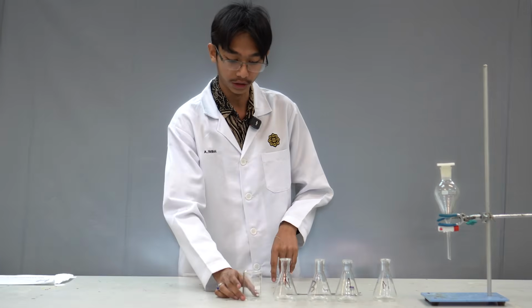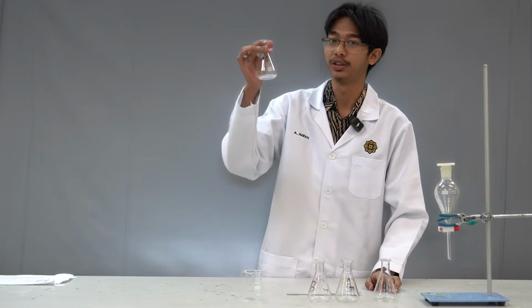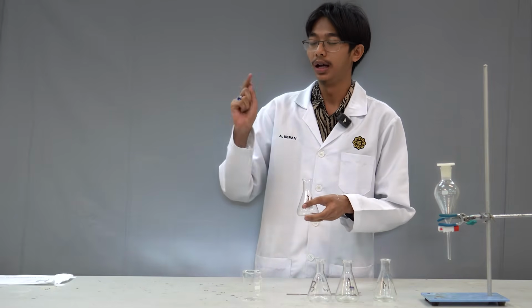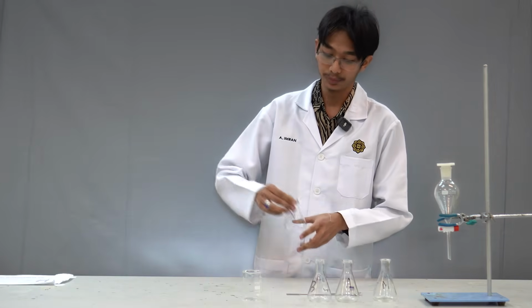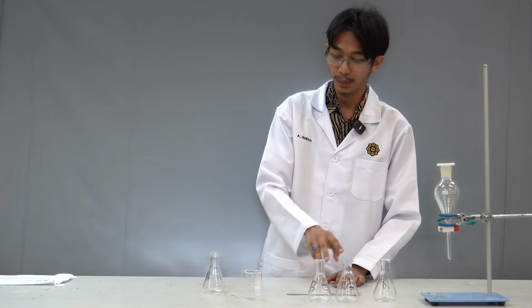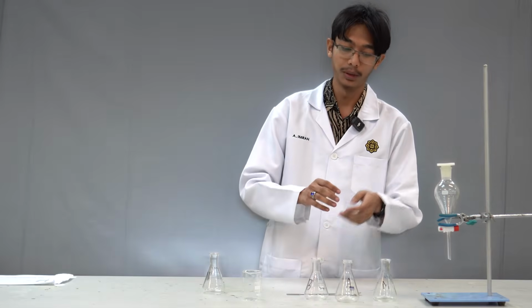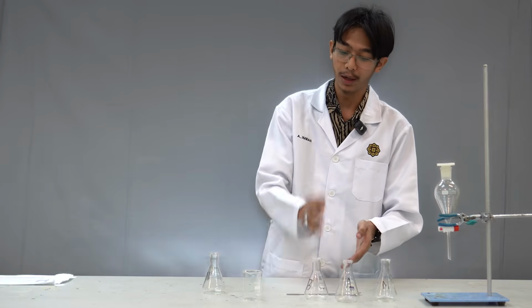The first point here is that we're going to have a flask. Let's just assume this is the mixture flask, shall we? This mixture flask is going to contain all of our acids, bases, our neutral compounds, and our organic solvent, which is dichloromethane. Another thing to consider: why do we have 3 other flasks? These 3 other flasks will be used because when we do the extraction, we're going to have other results. That is to say, we're going to have an acidic solution, a basic solution, and a neutral solution.